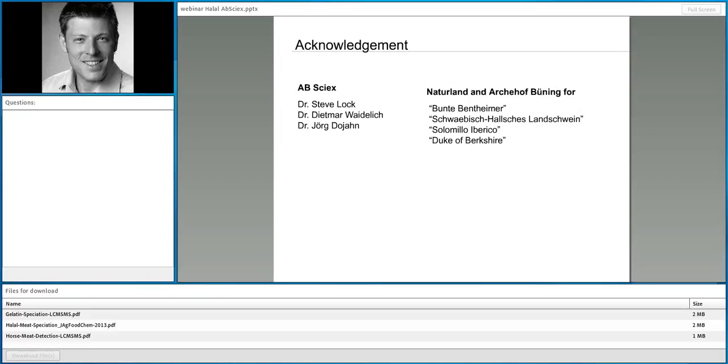It isn't even factor 2 or something like this. It is a slight reduction of sensitivity. You see more background, mainly I think because you extract more peptides and you might have Maillard products, and we really had deep fried meat products, but it still nicely works. We were surprised by ourselves, so yeah, it will work.